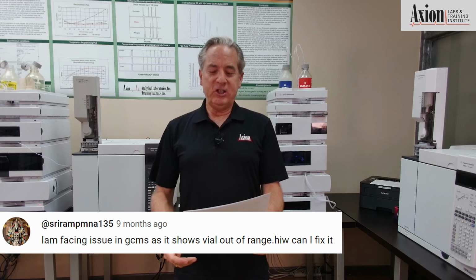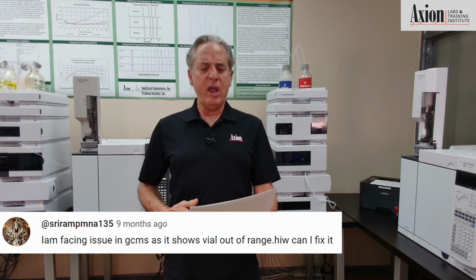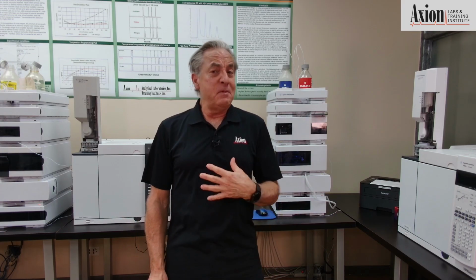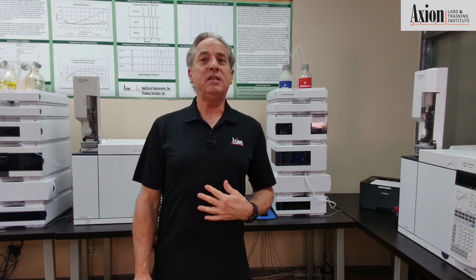I'm facing the issue on a GCMS spec and it shows vial out of range. How can I fix it? I hope this is going to be an easy fix. I'll just give you my experience. When the GC says vial out of range, it means you typed in a number that it can't access.